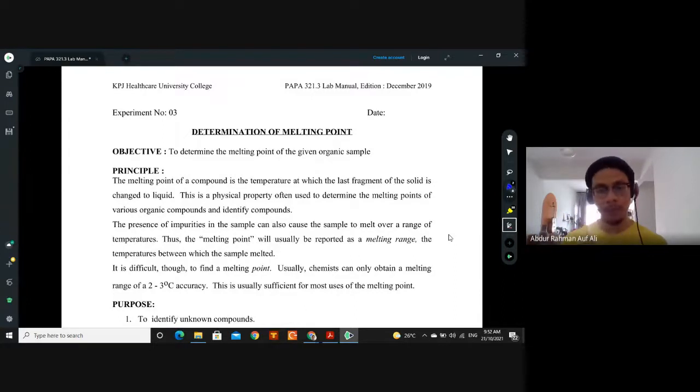In the Pharmacopoeia there is a section for chlorpheniramine tablet. The API, the color, the shape, everything to the smallest detail is written there. How to formulate, how to test, all the kinds of tests that can be done using alternate chemicals. If you don't have chemical A, you can use chemical B to perform different kinds of tests.